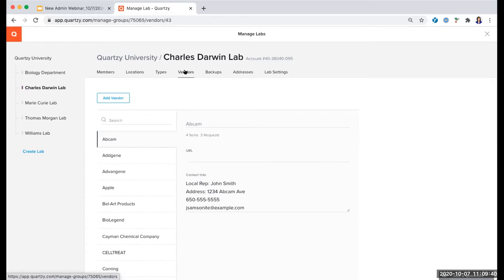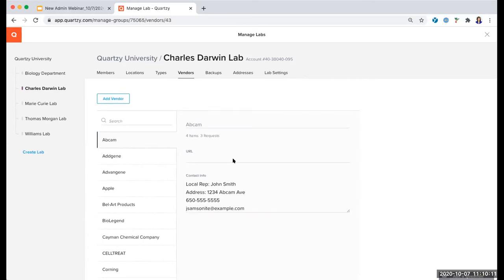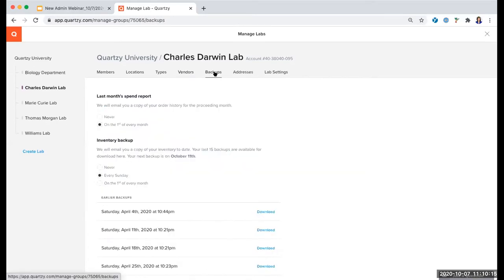Next we've got the Vendors tab, where you can see a list of all the vendor names used in either the requests or the inventory module for your lab, and you can add URL and contact information. While this is a good reference tool, it is not a section where you can select which vendors members of your lab can or cannot request from — members can enter requests for any supplier no matter if they appear on this list or not. Next we've got Backups. We strongly recommend receiving the monthly spend reports, where an email will be sent to you with an Excel file containing the details of all requests submitted within the past month, and either weekly or monthly inventory backups, which will have an Excel file of all inventory item details at that point in time in case there are any accidental deletions or changes and you want to restore an earlier version of the inventory.